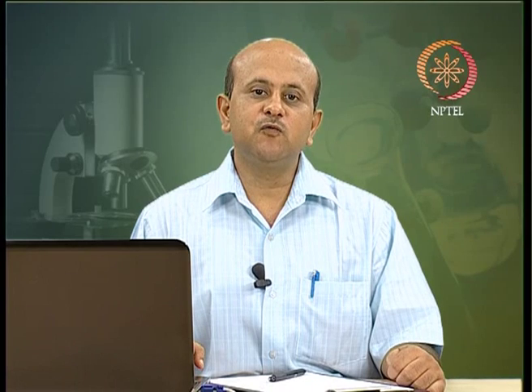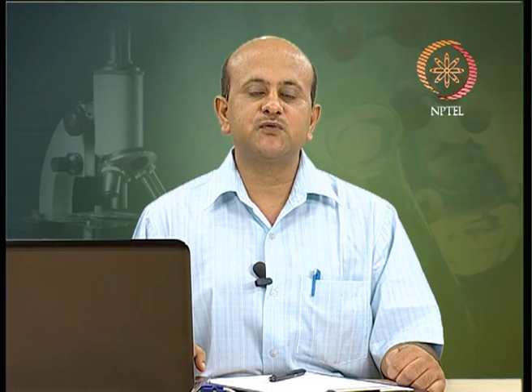Then there is the near UV spectral region, which is 250 to 350 nanometers, and here the chromophores, as we were discussing, are aromatic amino acids and disulfide bonds. We have discussed phenylalanine, tyrosine and tryptophan. They absorb at different wavelengths, and disulfide bonds can also give signals. So, the patterns obtained for phenylalanine, tyrosine or tryptophan can give important information about changes in conformation in the tertiary structure because of certain shifts in their absorbing patterns.